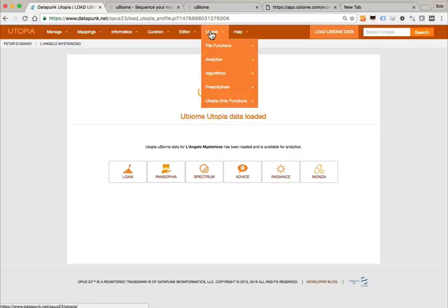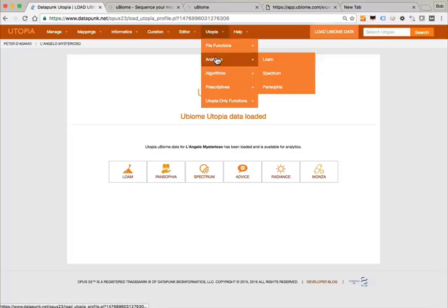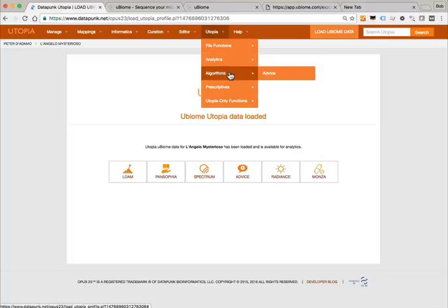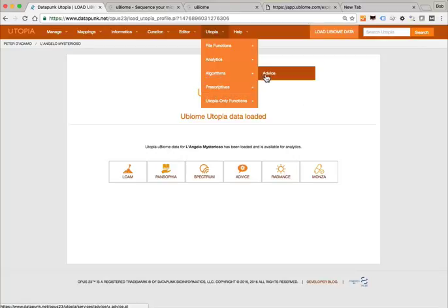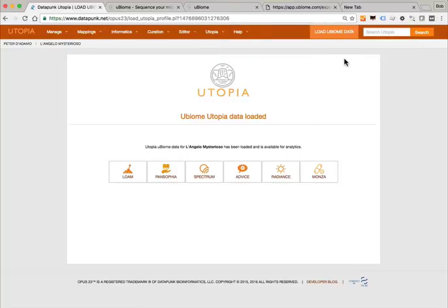Here we are at the uBiome utopia interface. You'll notice the environment has changed — there is an orange bar identifying that you're in the utopia program versus the blue bar which tells you that you're in the Opus program. There are a lot of very similar functions: a series of analytics apps, an app that does algorithmic analysis based on outcomes, and some apps designed for prescriptive advice. If you're comfortable with the interface for Opus 23 you're going to be very comfortable with the utopia interface.